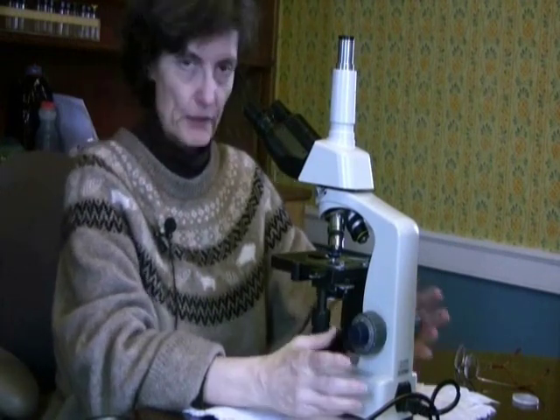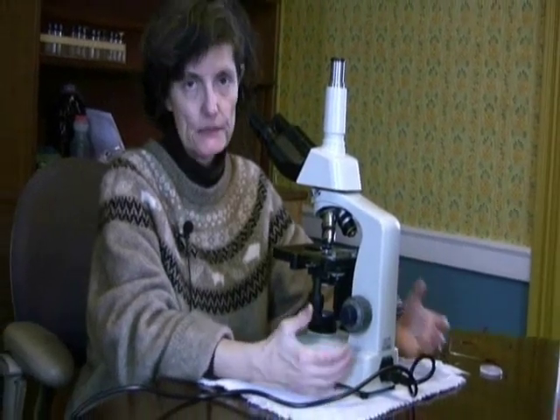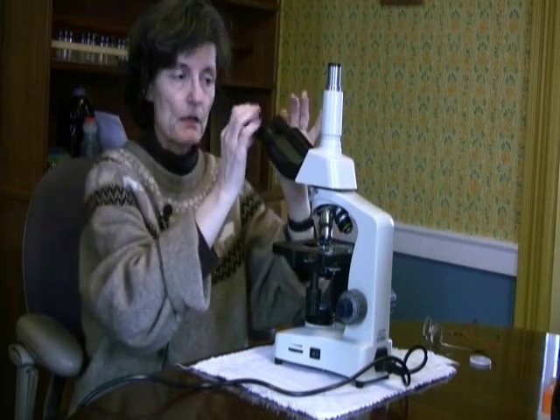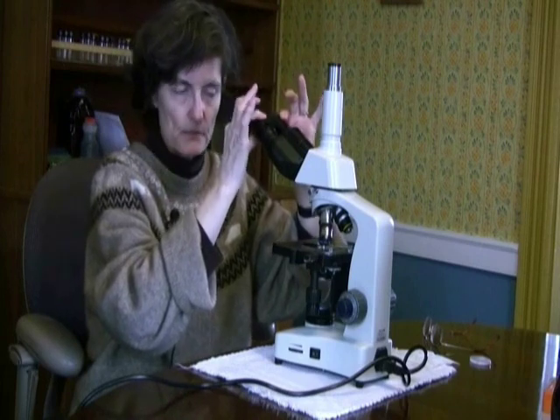When we're considering buying a microscope, the things you really need to have to be able to look at bacteria, fungi, protozoa, and nematodes pretty easily, not a very expensive microscope. The critical things to have are the binocular eyepieces, 10x wide field eyepieces.